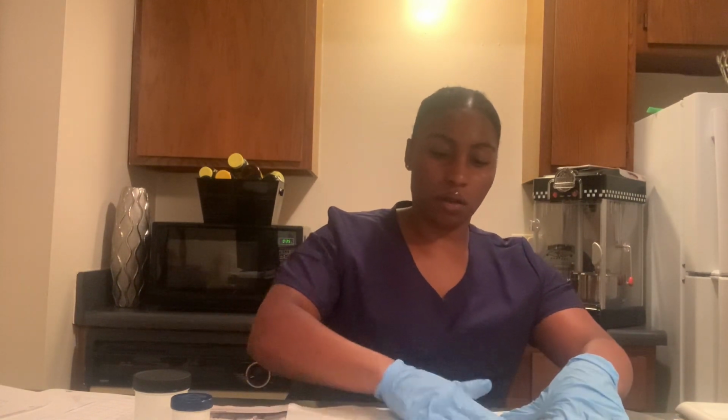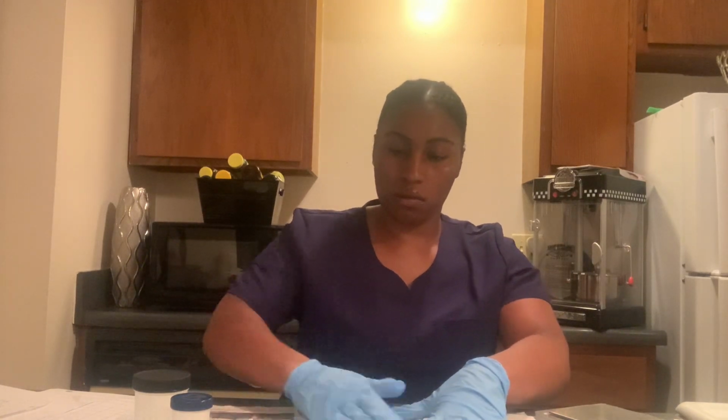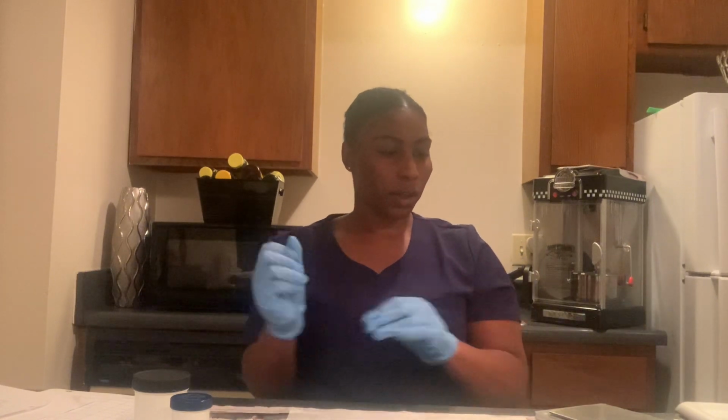And then we clean this. So all right. Okay.